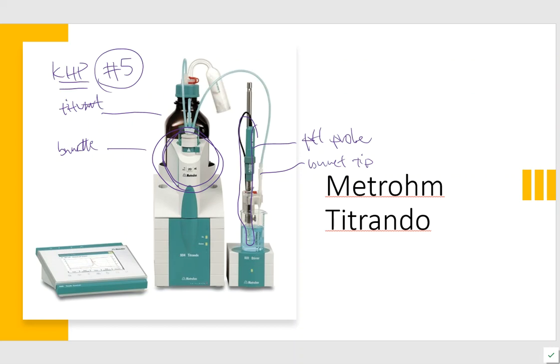So this will be loaded up. It will be ready to go. The only thing that you have to do is come over and put your sample on there, mix with a little bit of water, put the probe down on the inside of it, and we will show you how to operate the software. And this instrument will titrate for you automatically and provide you a concentration for the NaOH.